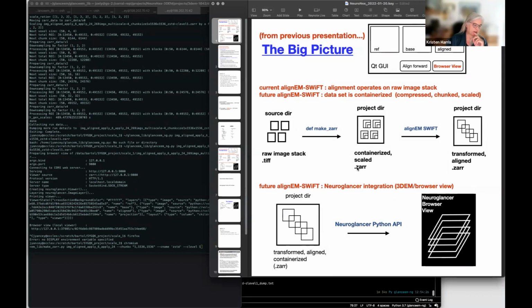Okay, great, thank you. The data inside the ZARR is just grayscale values in arrays. So no matter what image format, at the end of the day, like Tom said, it's just values. If you can strip all of the header off the image files, what you're left with is the same, unless it's a proprietary, weird format that's locked up so you can only use it with their software. Those formats might be a little more difficult. But for the common file formats, there shouldn't be any problem extending the ability to put those into ZARR.